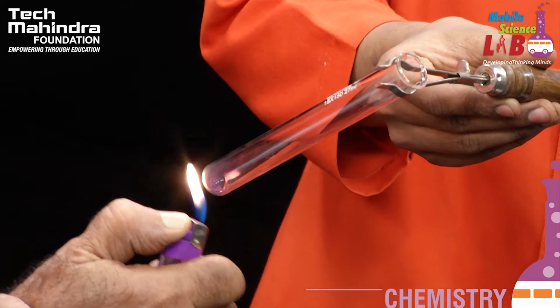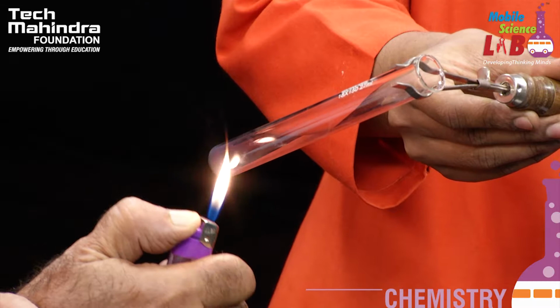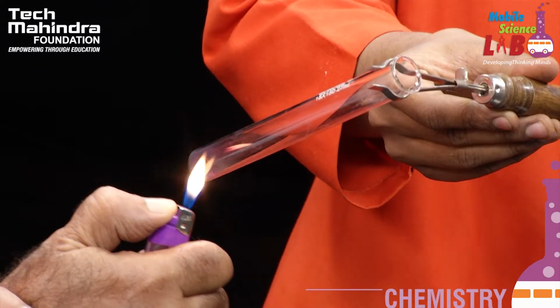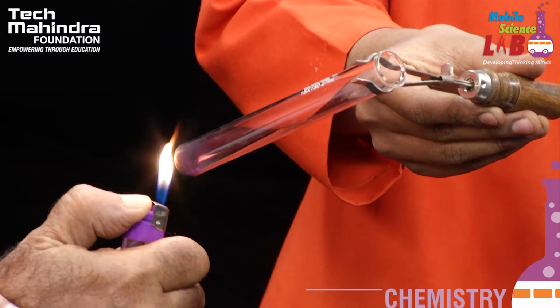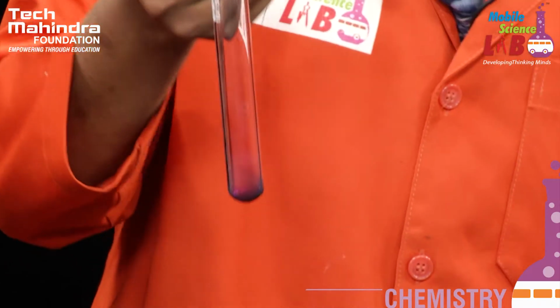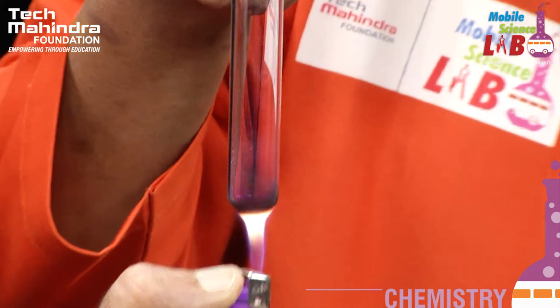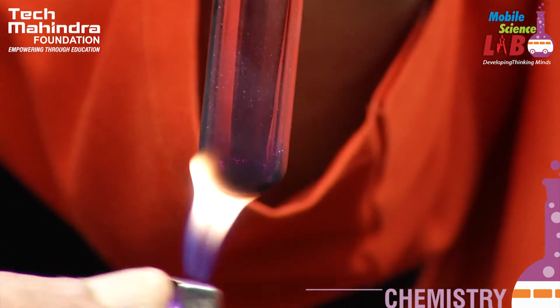You are beginning to see some change over here. Purple color I could see. Yes, that's right. There is a development of purple vapor over here. Do you see any liquid over there? No, sir, there is no liquid at all. You can see a slight amount of purple color. Now keep your test tube straight. Okay. And I'm going to heat it from this side.